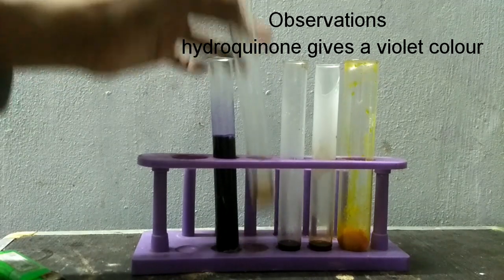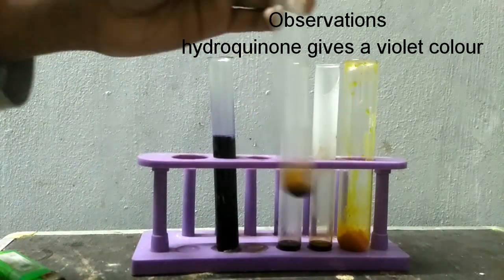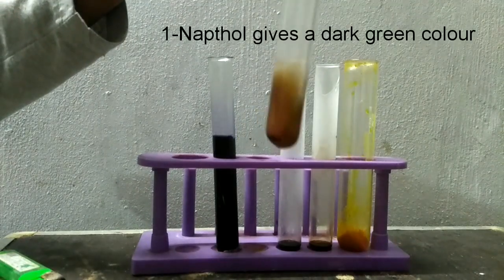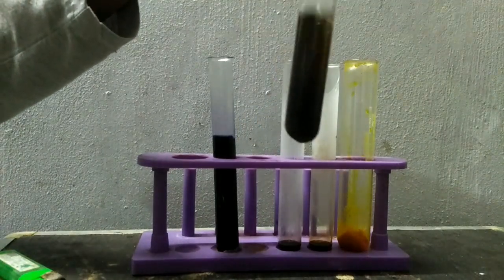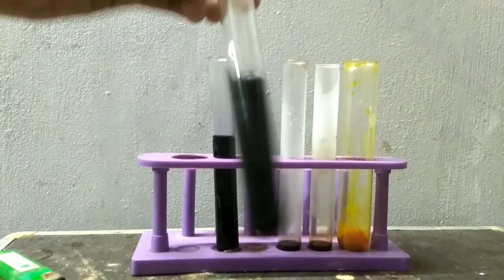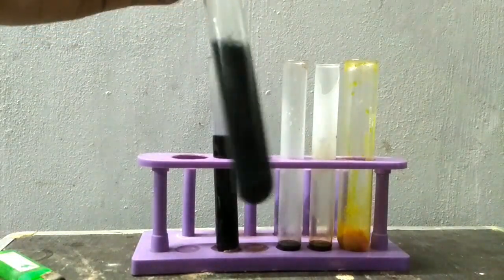Now we will add sodium hydroxide to the alpha naphthol one. We get a dark green color.